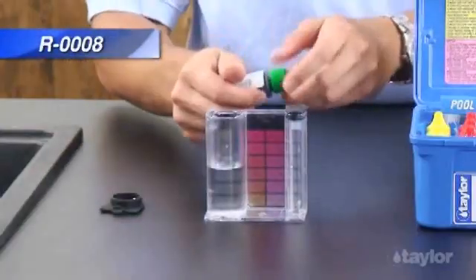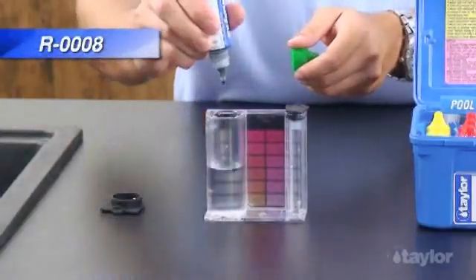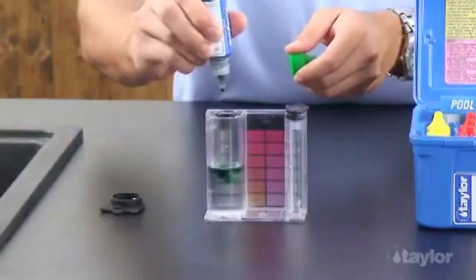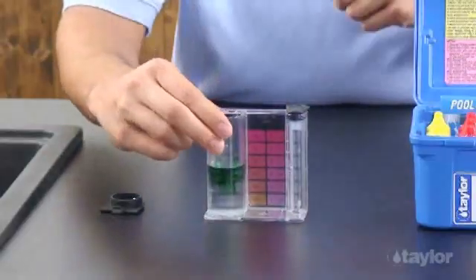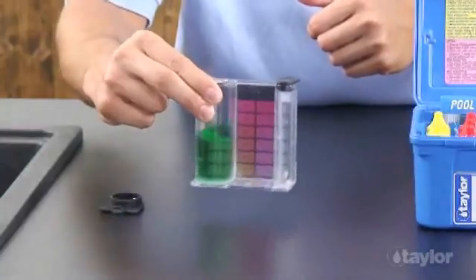Add five drops of reagent 8. Swirl to mix. The sample should turn green.